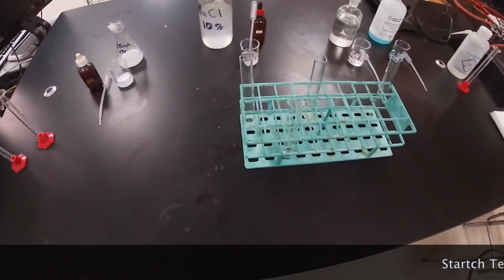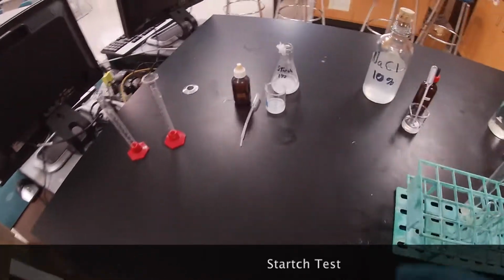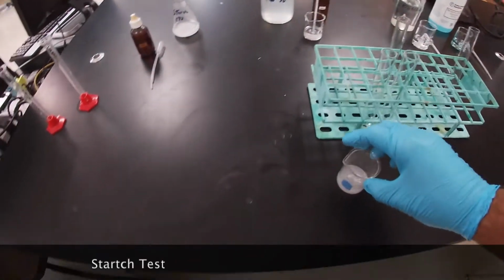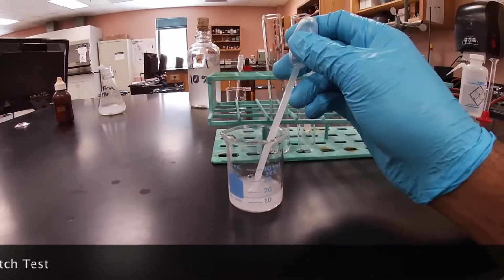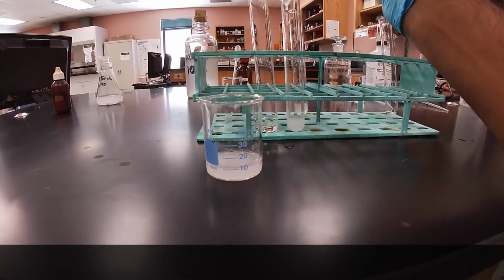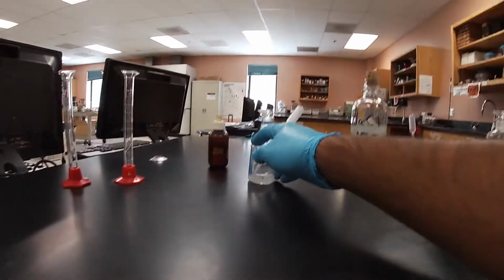Okay, for the next test, we're going to use another test tube, and we're going to do the starch test. And so for this, we're going to measure out 3 milliliters. Just going to give it a little shake. And so here, we're going to add approximately about the same amount to our test tube. Eyeball it. That's about 3 milliliters. And then I'm going to go ahead and return it.